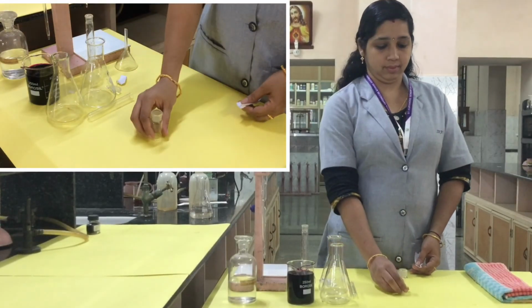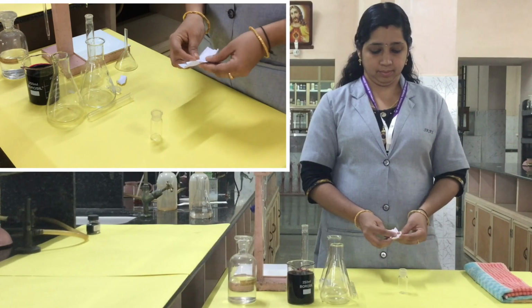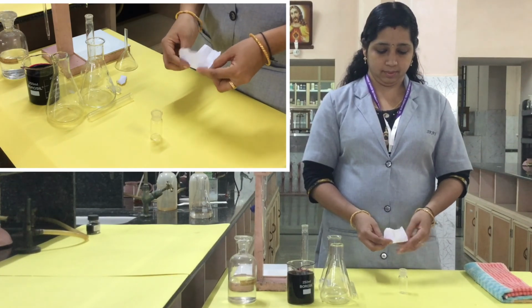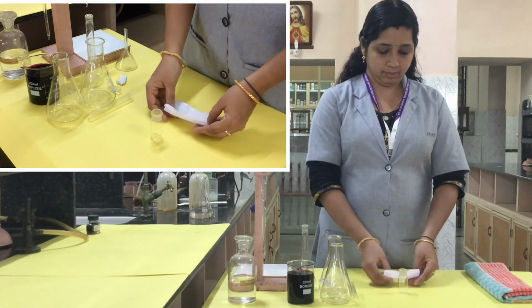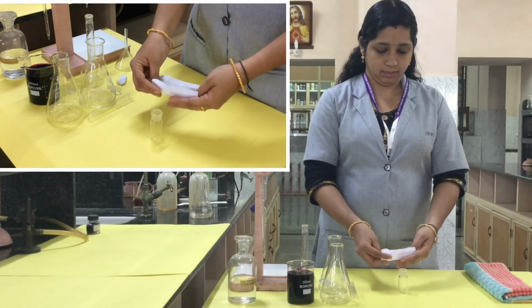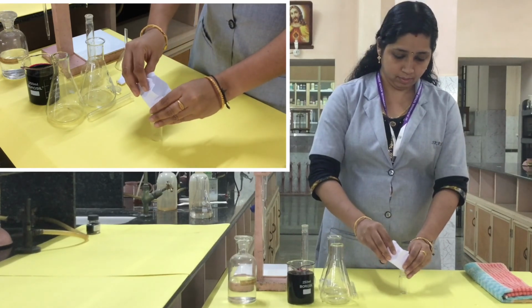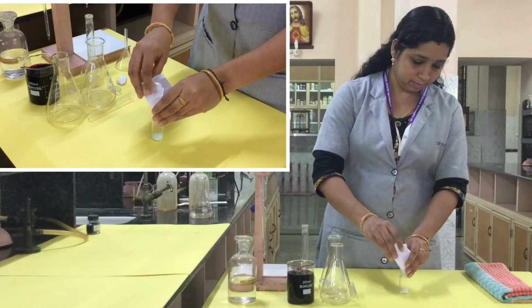Preparation of standard solution of Mohr salt. The solution whose concentration is known is said to be standard solution. First you have to prepare the Mohr salt solution, that is the standard solution in this experiment. So first of all, transfer the Mohr salt that is provided within the paper into the weighing bottle. Carefully transfer the Mohr salt into the weighing bottle.